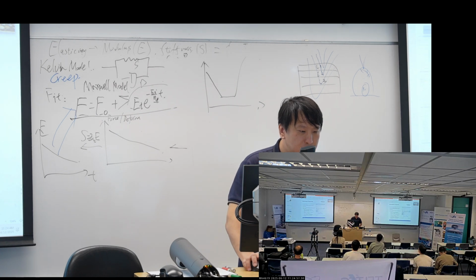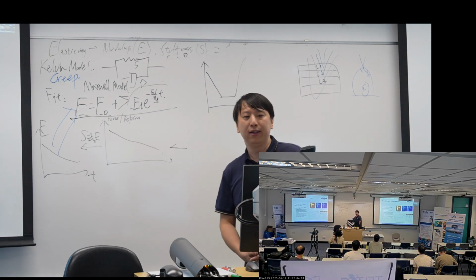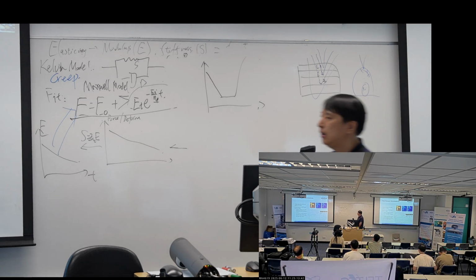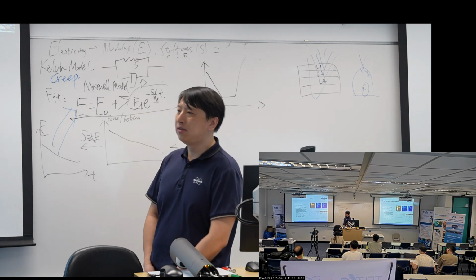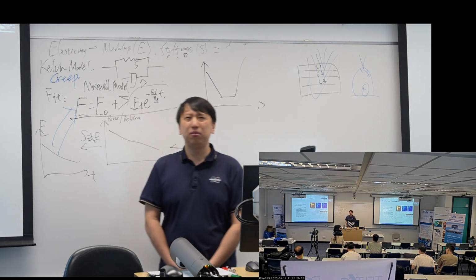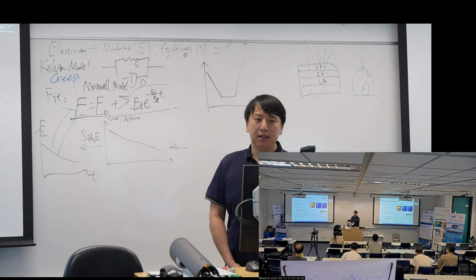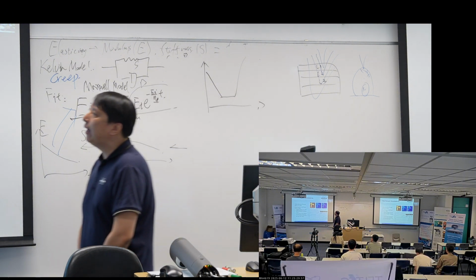And let's show an example, and we can end the morning session and go to the hands-on session. Bruker did one experiment, or not by Bruker, I think it's by some professors in Paris or something, sorry, in France. He is doing just a demonstration, and he has E. coli.